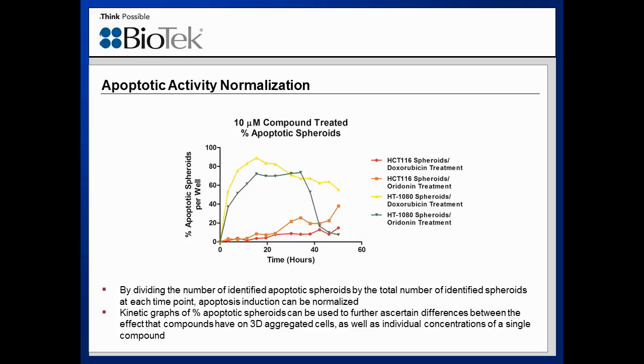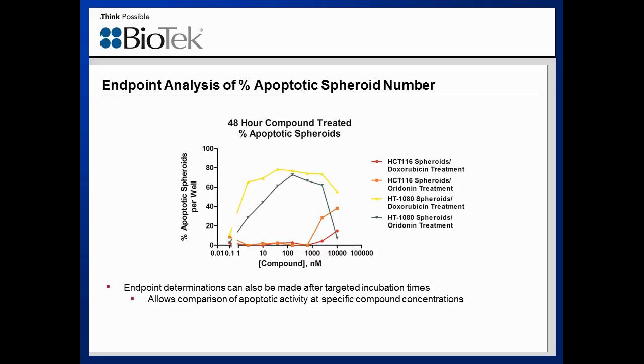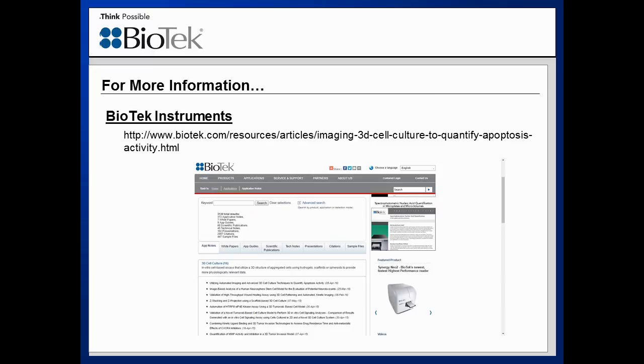We can also look at a single time point with different concentrations of drugs, as you can see here. So you can either perform endpoint analysis or, again, live analysis using kinetic data. If you'd like further information, you can go to this website to see more about how the project was performed.